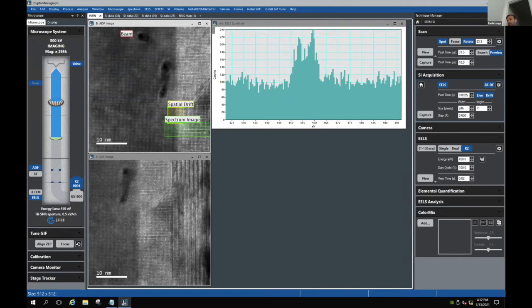That doesn't apply to the CCD because in the case of a CCD, you move charge pixel by pixel. So you bin because you want to combine pixels together. And when you combine pixels together, you actually reduce the number of pixels that you need to shift the charge. So that would buy you a lot of time. At the same time, you're combining pixels together. And that leads again to a previous question I was asked, if that would help in the case of a K2. But in the case of a K2, you read everything at the same time, you read out.